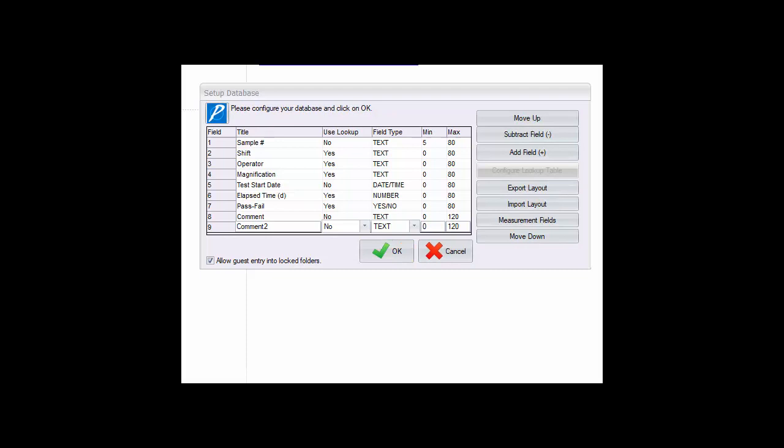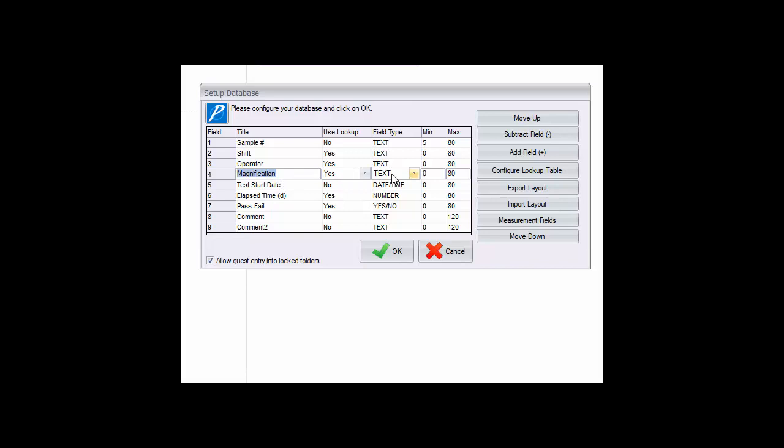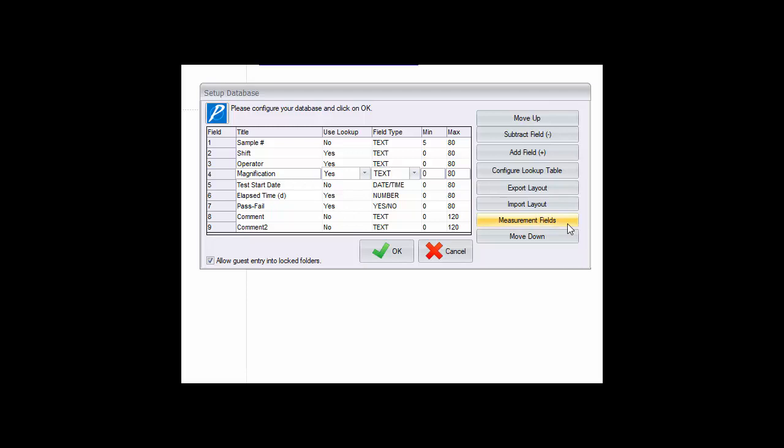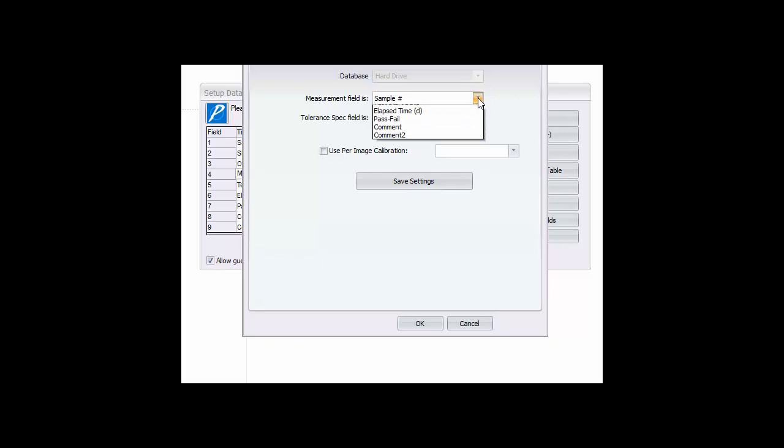If you will be making measurements on images, the system must be calibrated to the optical conditions. So a field should be created with a lookup table for the various magnification entries so that any entry may be calibrated. Click on the measurement field button to open a dialog allowing you to designate the particular field that will be used for your calibrations, and be sure to click save when done.